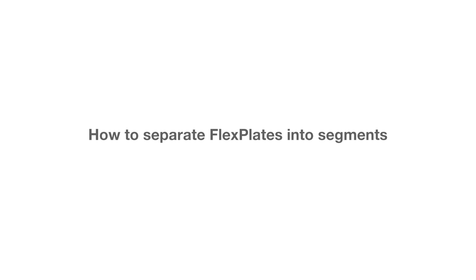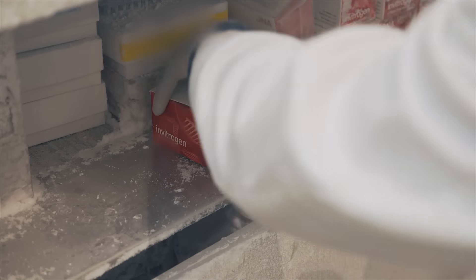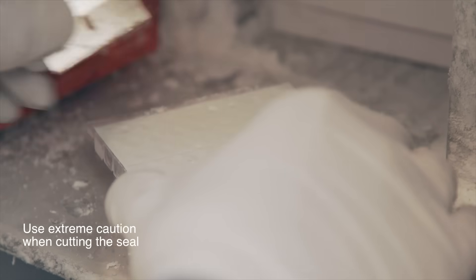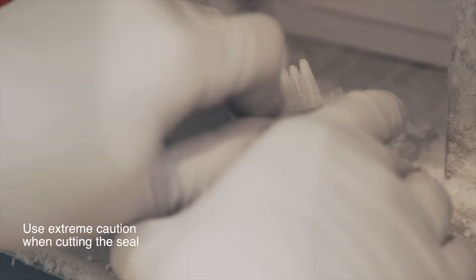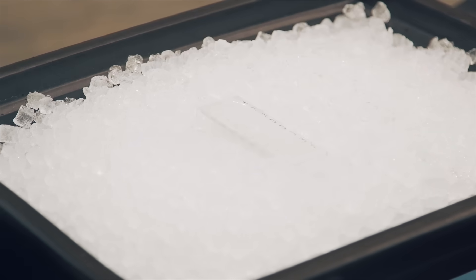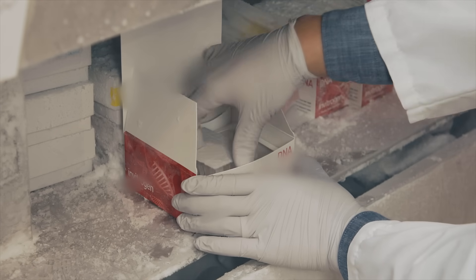Let's look at how you can separate flex plates into segments. Obtain the flex plate from your minus 80 degree freezer. While keeping your plate in the freezer, select the number of segments you would like to use for your experiment by scoring the heat seal with a razor blade. Snap off the columns, quickly transfer the cells you will be using to an ice bucket, and retain the unused portion of the flex plate in the minus 80 degree freezer.